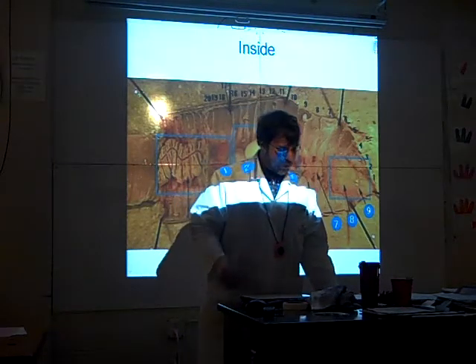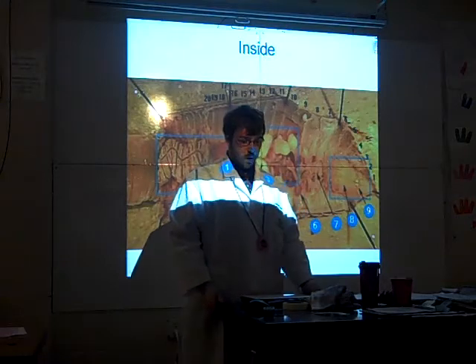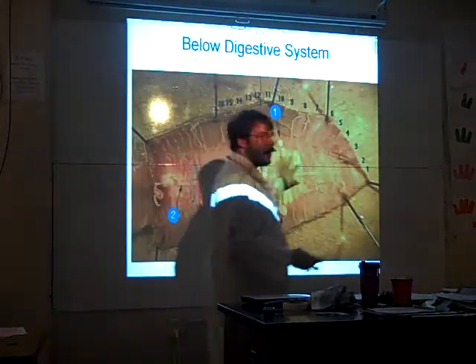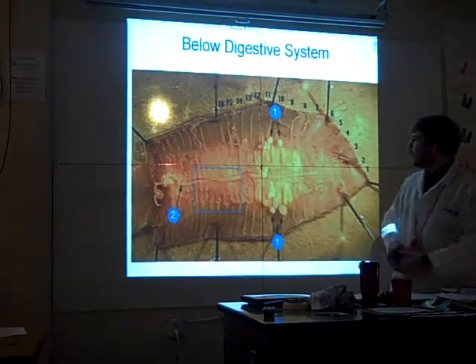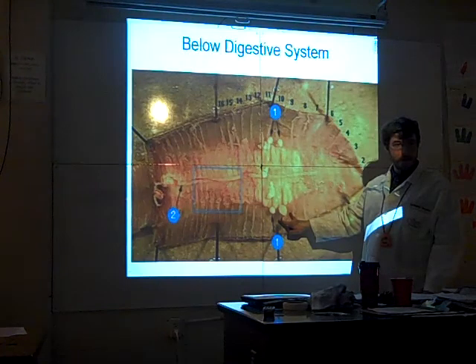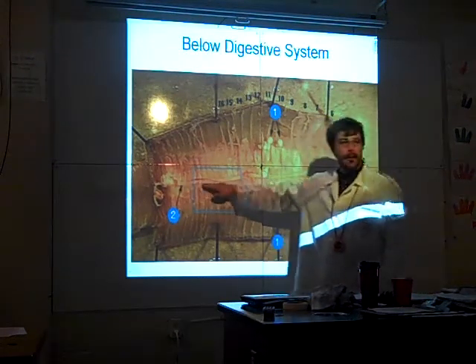By the end of the day today, you should have the front and back of the first page pretty much done. This is our only day with the worm. If there's enough time, you'll be able to remove all the digestive and sexual organs. You'll be able to see its nephridia. What are those? Kidneys. It's little kidneys.